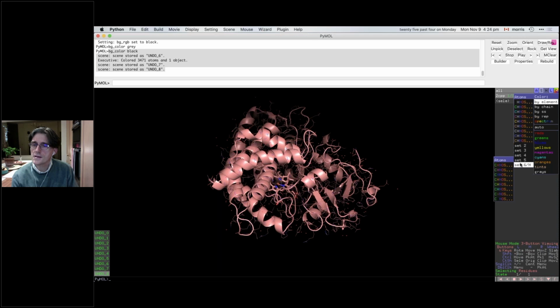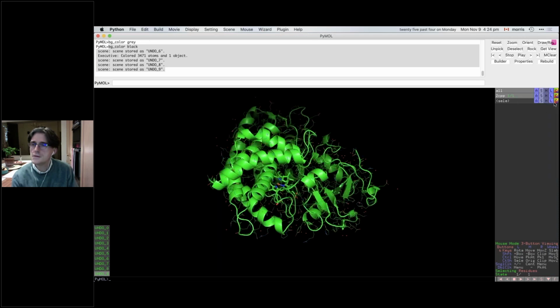In that last one, you get some wackiness in the way the hydrogens are colored. Yeah, so that's variation in coloring the hydrogens, and that very last one has hydrogens black. All right, so I'm going to go with white carbons.